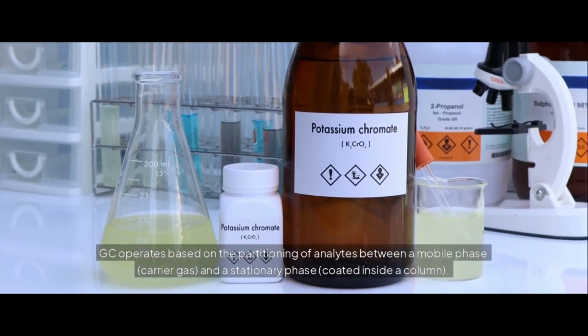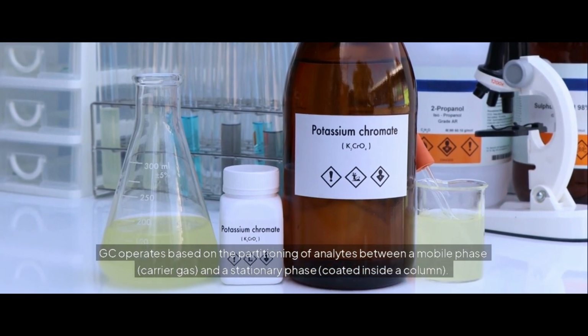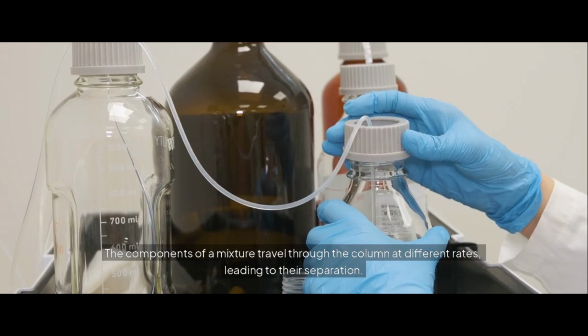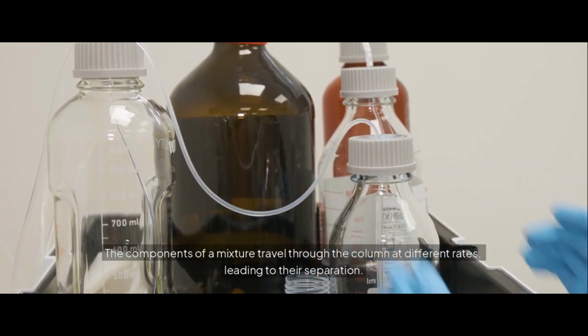GC operates based on the partitioning of analytes between a mobile phase, carrier gas, and a stationary phase, coated inside a column. The components of a mixture travel through the column at different rates, leading to their separation.